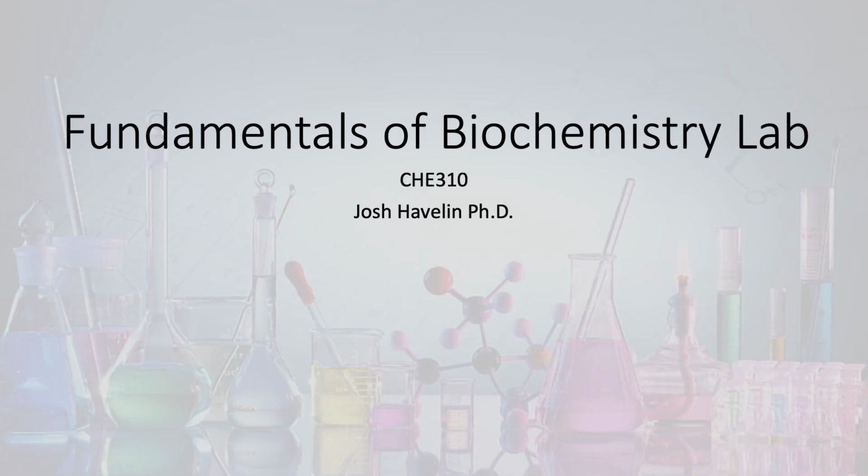This week in lab, we'll be starting our RT-PCR section, or section 1, where we analyze the differential effects of our environmental toxin on gene expression, right? Genes of our choosing.